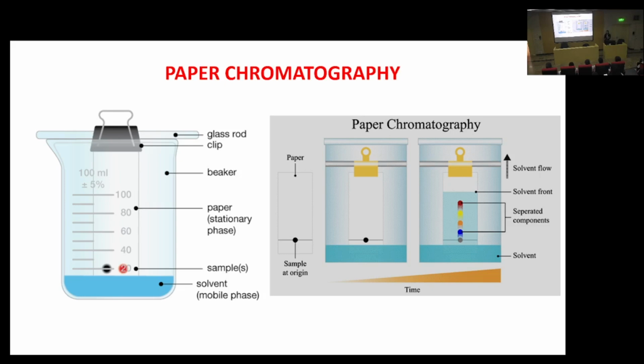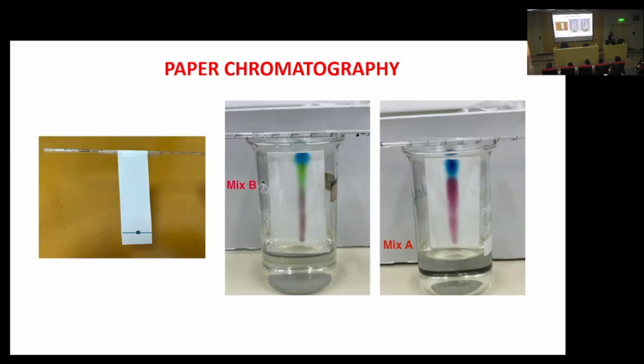The blue one, exactly. So this is what we mean, that the affinity to solvent, adsorption to the paper will determine how much separation will occur, all right? And in this case, how far these components will travel, all right?